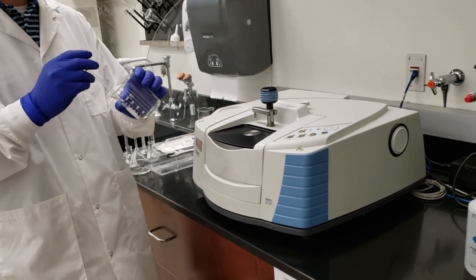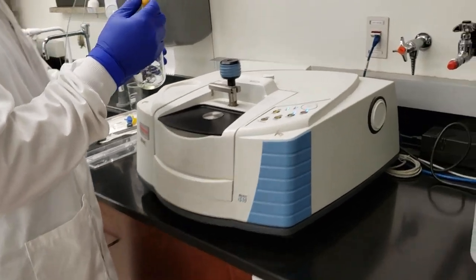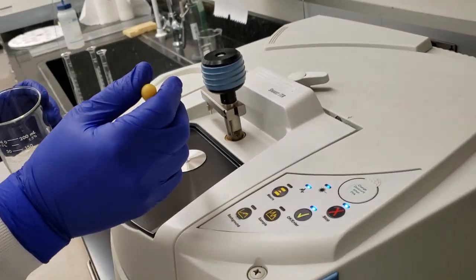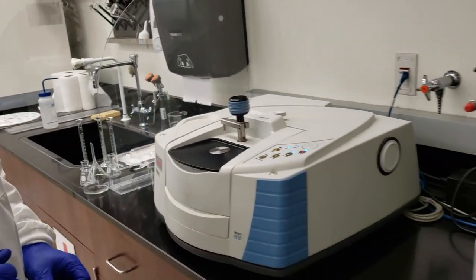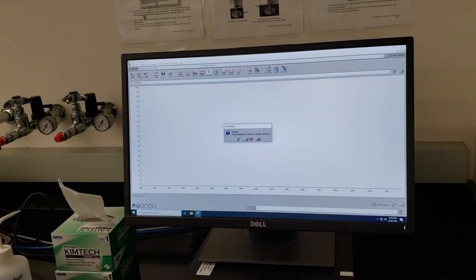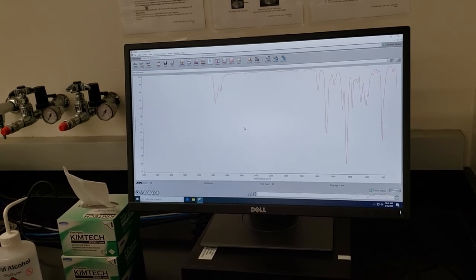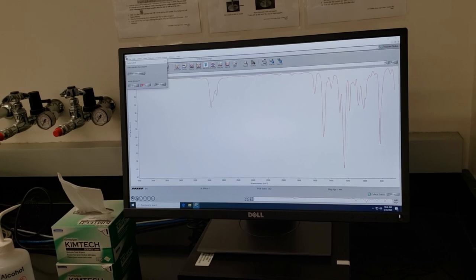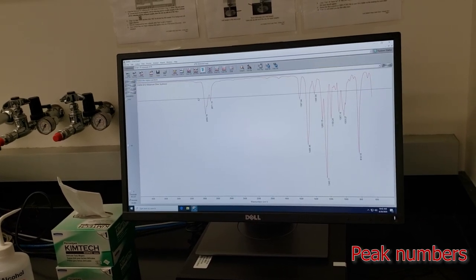So we brought our Williamson ether product over here to the IR. We're going to go ahead and place a drop on, we'll do two drops on our diamond window here. We don't need to put the presser arm down, so we've covered our diamond window. We've already taken a background, so we're ready to collect our spectrum. Okay, we'll add this to the window. I'll go ahead and do a find peaks here so we can get some numbers.